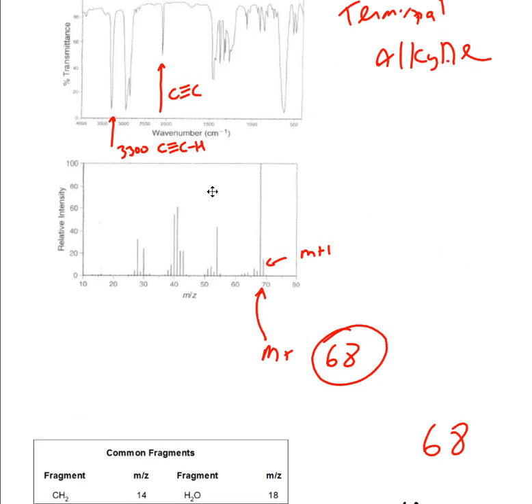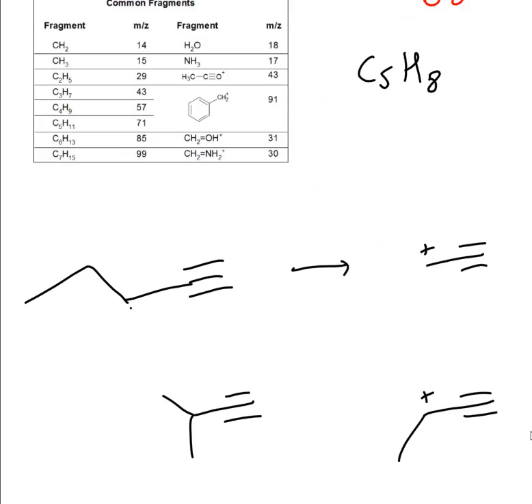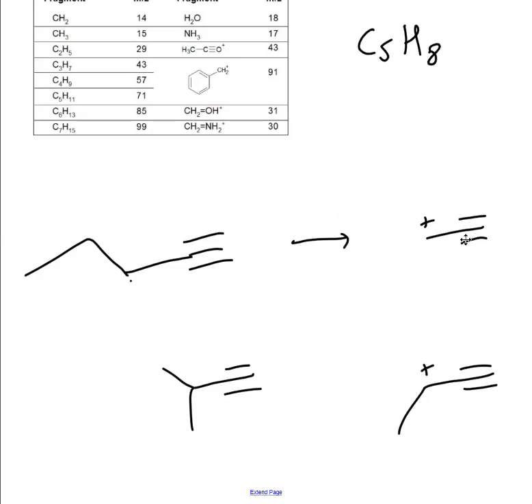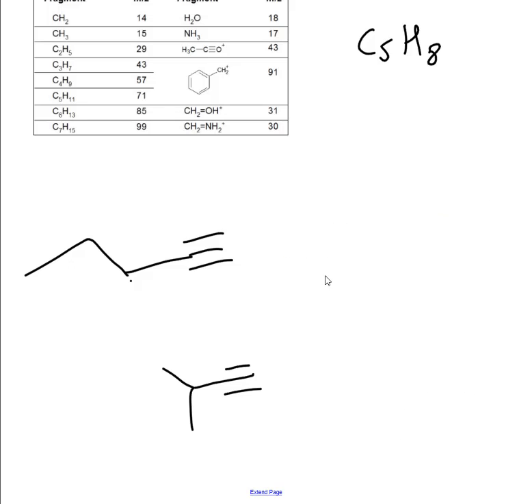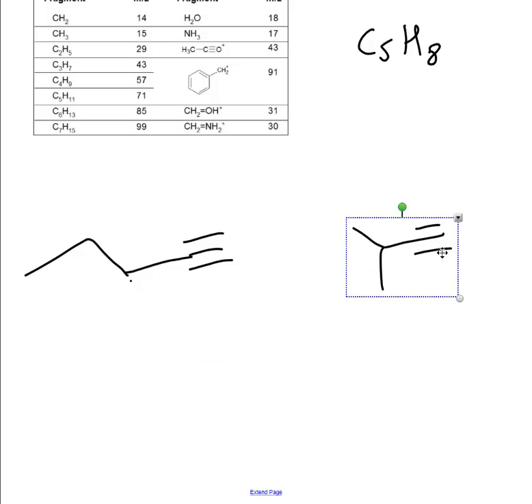If they made the base peak somewhere over here, then we could figure out, okay, is it 3 carbons or 4 carbons, you know? But in this case, we will have 4, we will have 3, we'll have everything. So it really comes down to just these two. And that's your answer. Okay, so these are the 2 answers that they're looking for.